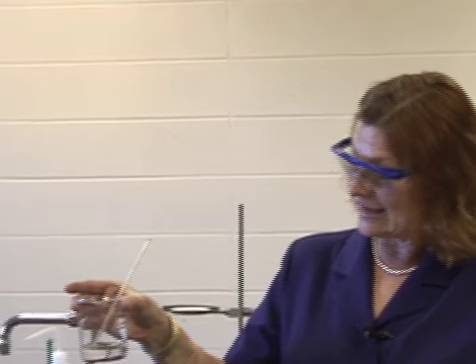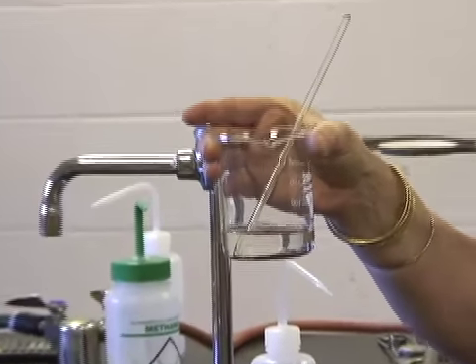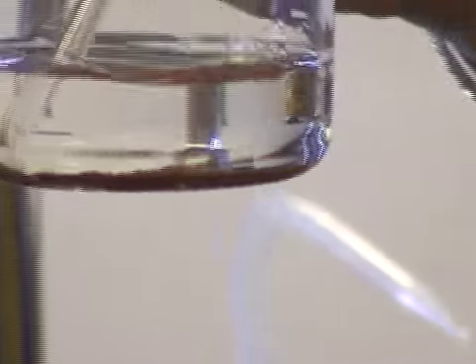Here we are on day 3 of our percent copper lab. It's so exciting because today we'll find out how we did on this. Well, I have my solution of zinc and sulfate ions, and the copper is on the bottom. And we must just clean up this copper and dry it, and then we'll get our final mass.